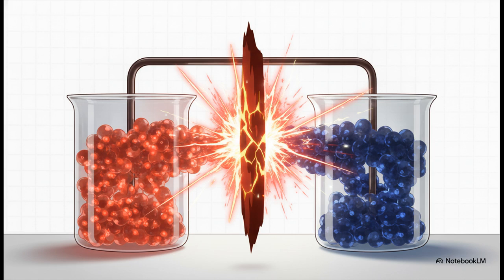The salt bridge swoops in and allows inert ions to migrate between the beakers. This maintains electrical neutrality, so the current can just keep on flowing.